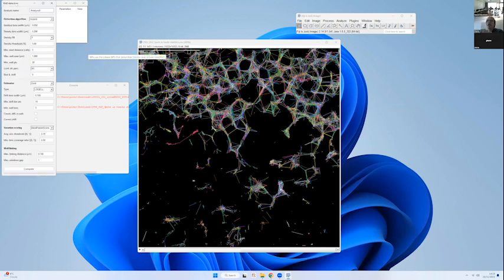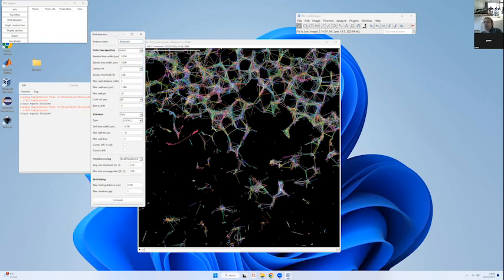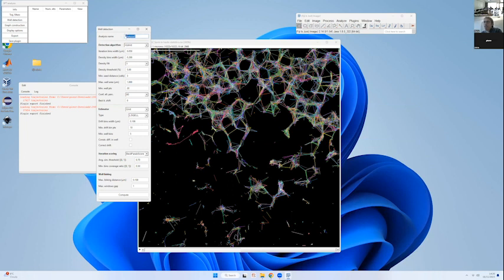Okay, now well detection. So this is a big menu. Here, the first thing is you need to give a name for your analysis because you can have multiple analyses saved in the plugin. By default, it's analysis 0, 1, 2, etc. Now here you can specify what type of algorithm you want to use, and then you will have options related to the algorithm. So you can choose what type of estimator you want to use, what type of scoring.